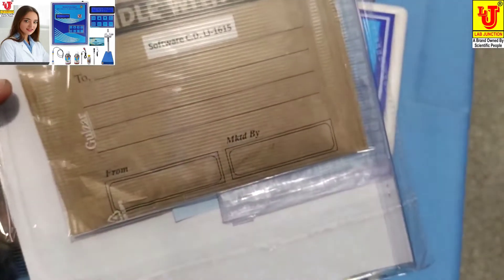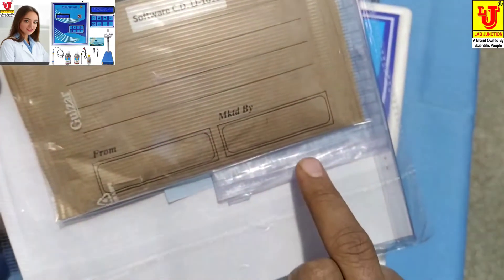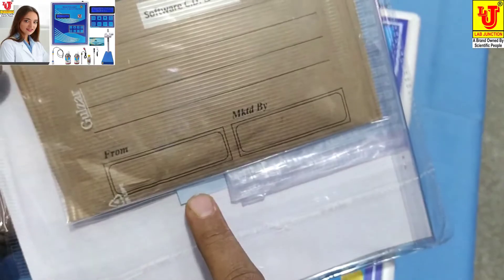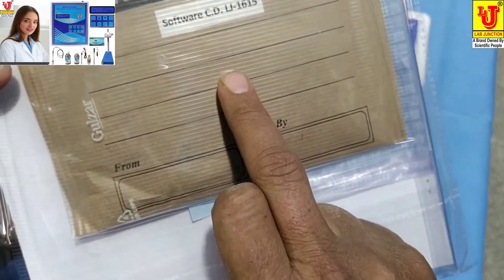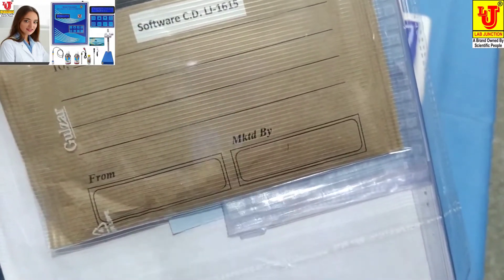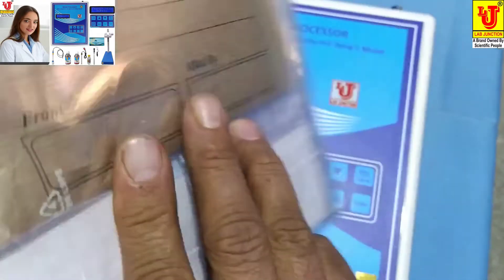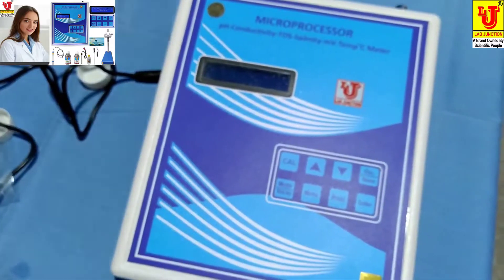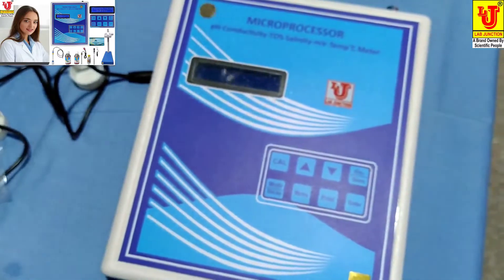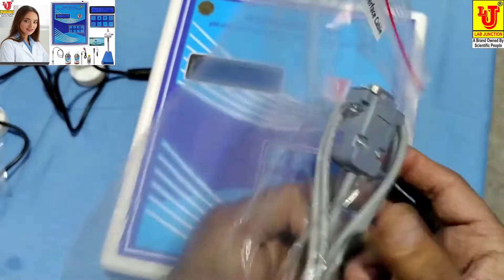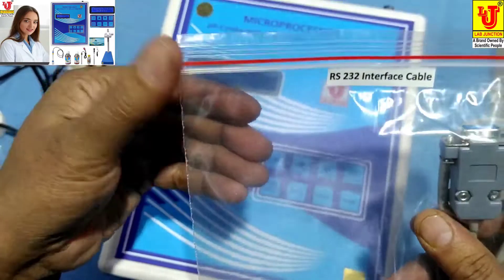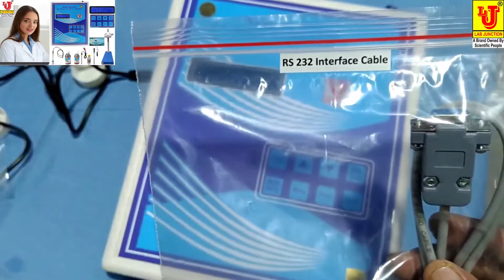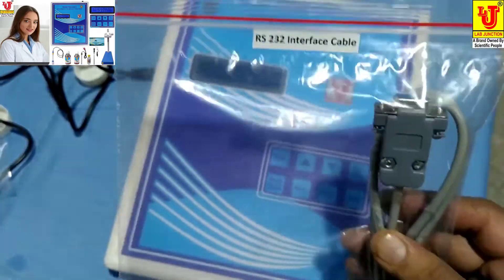Also supplied: a dust cover, warranty card, and software CD to interface with a PC. The interfacing is done via an RS232 interface cable.